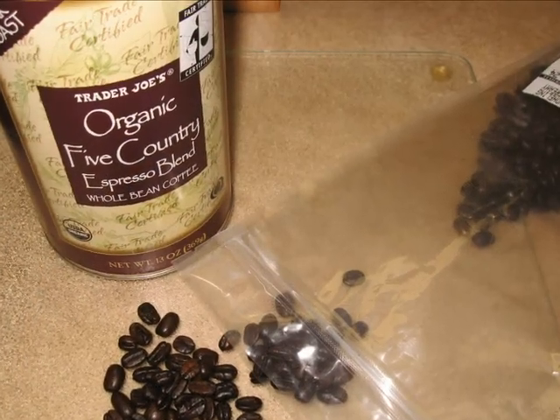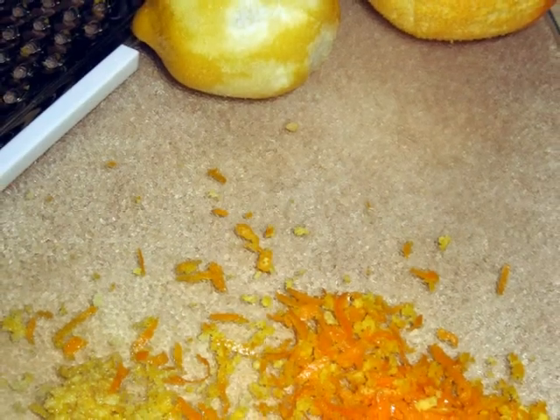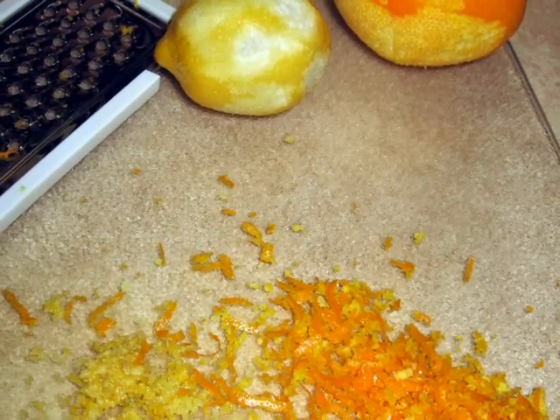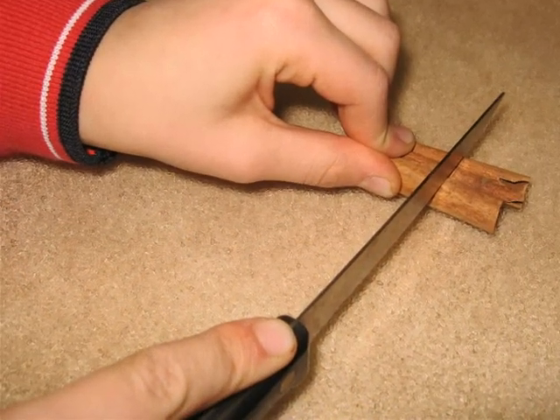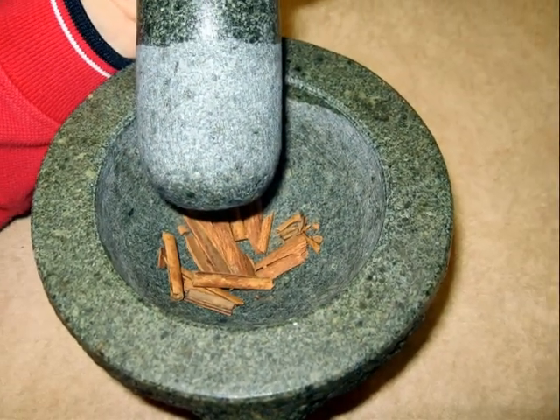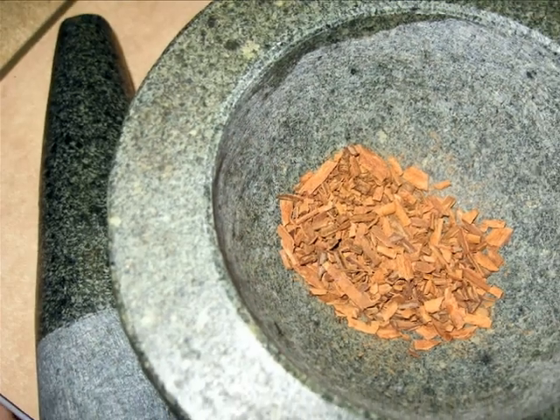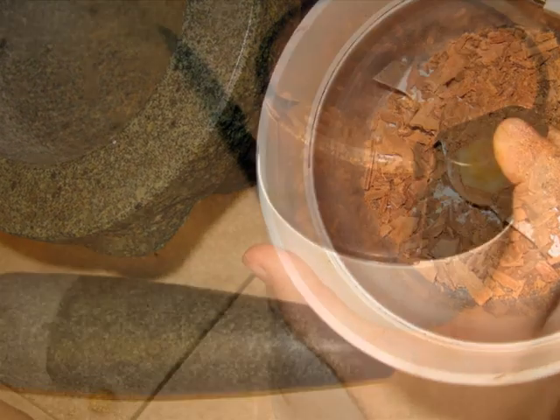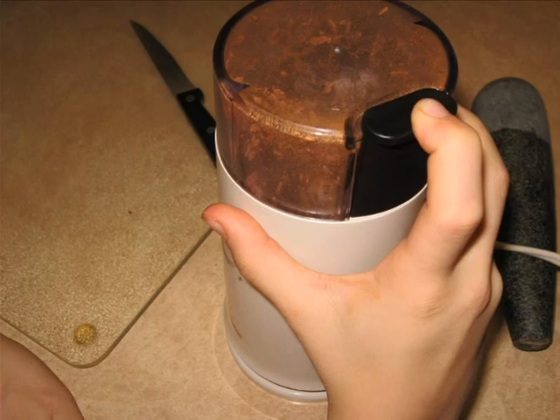The first step is to choose the essential oils you are trying to isolate. If you pick a fragrance that has a strong smell, it will be easier to extract. Whatever you choose, make sure you grind it up into small pieces. You can do this using a mortar and pestle, or you can use an electric grinder. The idea is that you want the particles small to increase the surface area.